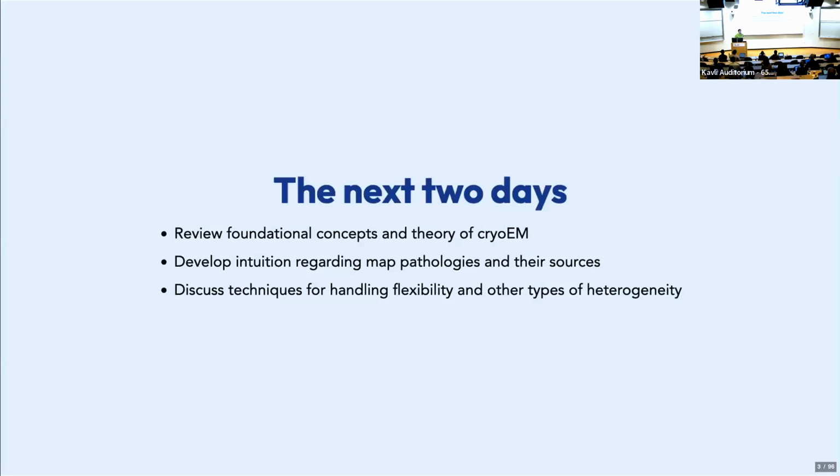And then finally, basically every single person has to deal with flexibility and other types of heterogeneity. I think that is one of the huge advantages of cryo-EM over some of the other ways of getting 3D structures of macromolecules. So we'll definitely be talking about that some, and I bet some other speakers will too.